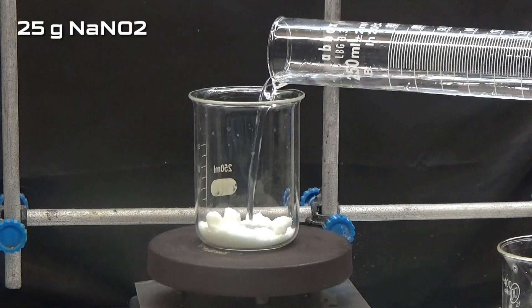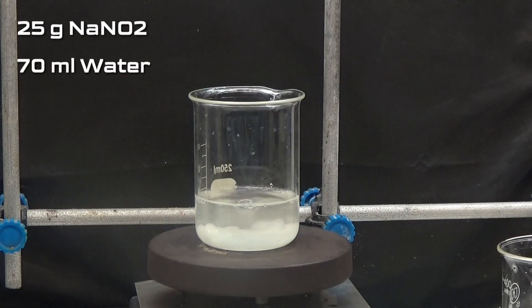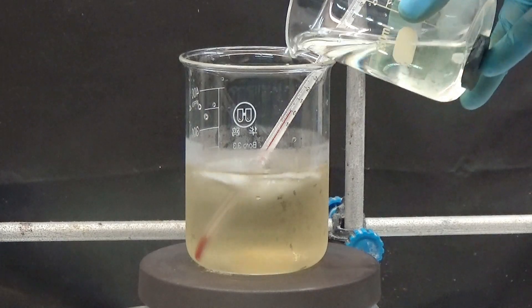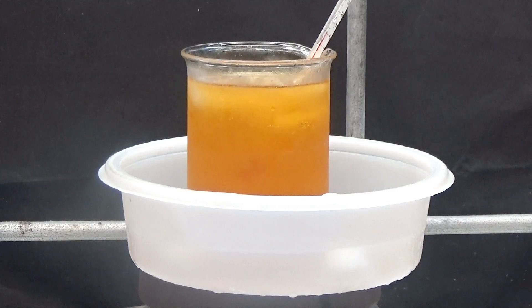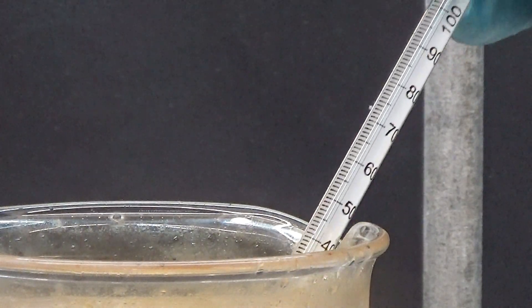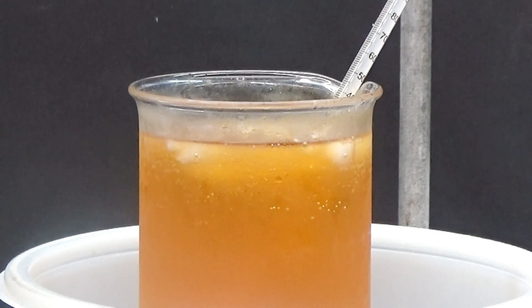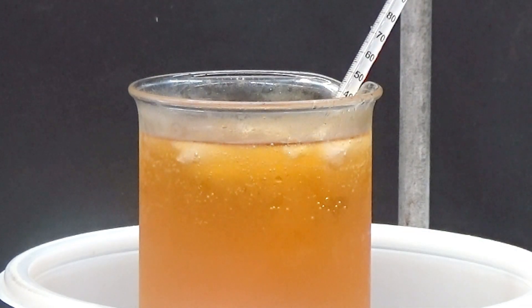In another beaker, prepare a solution of 25 grams of sodium nitrite in 70 milliliters of water and keep cold with an ice bath. When the nitrite solution is cool enough, add over the orthotoluidine solution, the temperature should be kept between 0 and 5 degrees. The diazonium salt is formed with gas formation and orange color change. Keep the diazonium salt solution under stirring for 15 minutes.